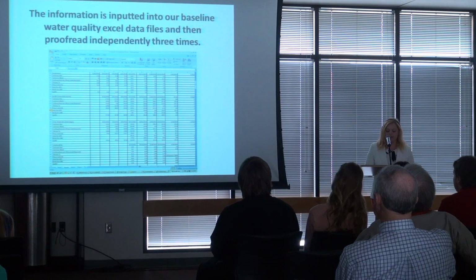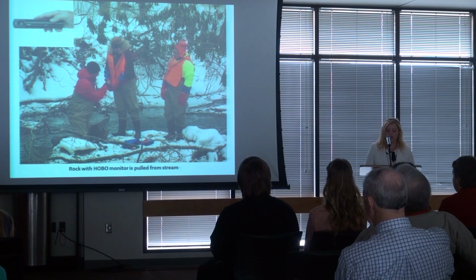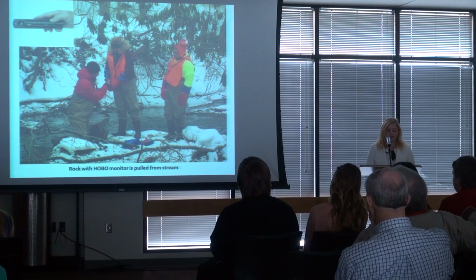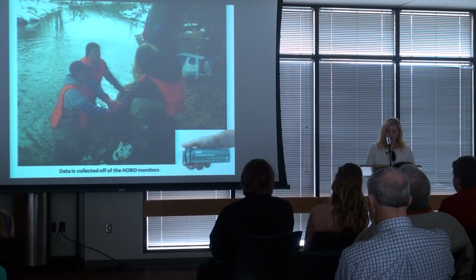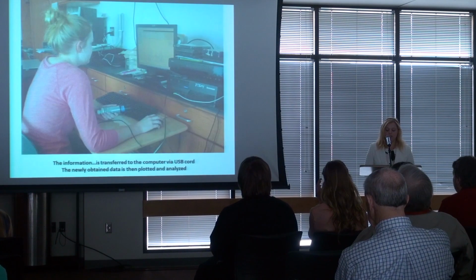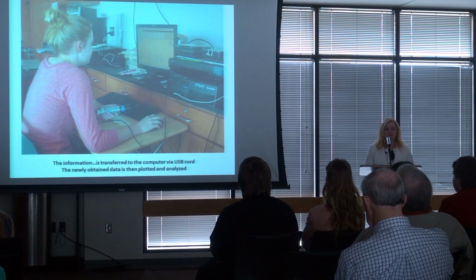Additionally, at all sites except those of the water treatment plant, a HOBO continuous conductivity logger is removed from the water and inserted into a shuttle. This device records conductivity every hour around the clock. After insertion, the data from the previously submerged HOBO meter is downloaded to the portable shuttle memory storage device. The retrieved information is then brought back to the classroom, where it is transferred to the computer via USB port. The newly obtained data is then plotted on graphs.